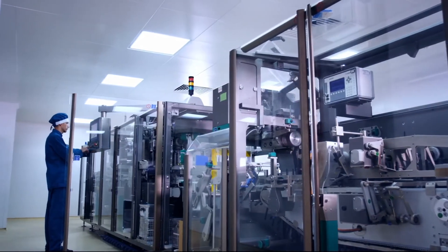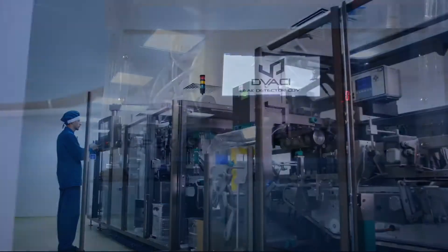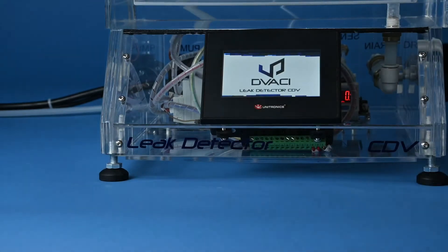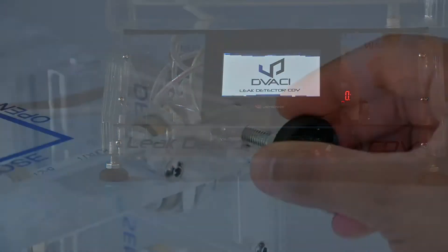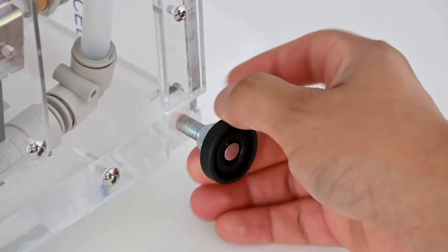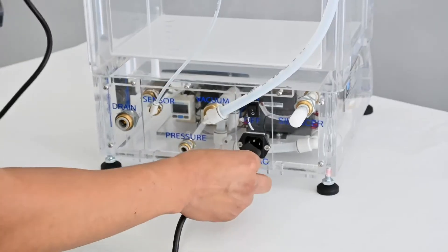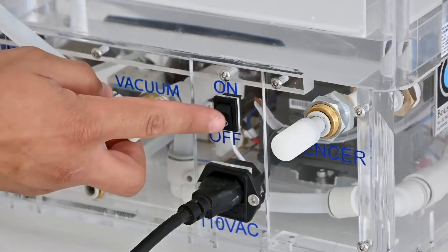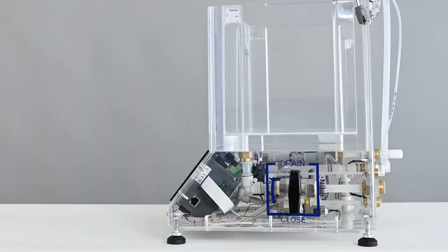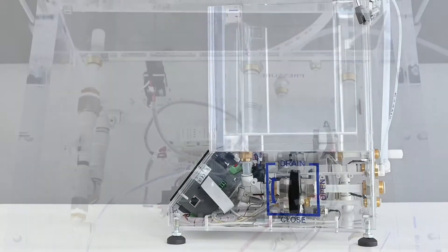The control devices are an important part of the design concept and we are aware of the possibility of restricted available space. Therefore, we have designed the CDV-BT vacuum chambers to minimize their space by intelligently placing the control console underneath the testing chamber.